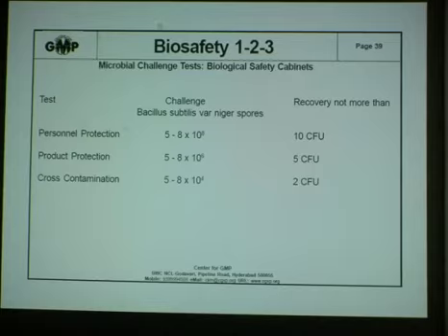Now the next thing you'd like to know is, is my culture protected? So, is the laboratory environment likely to compromise my culture? So how do you know that? You aerosolize a culture of subtilis from where the operator is sitting and try to see if you can capture or recover subtilis at the work surface. The procedure is explained in the standard. Now you aerosolize approximately 5 to 8 × 10^6 colonies where the operator is sitting and see if you can recover anything at the work surface. Ideally, you should recover nothing, but the limit given to you is 5 CFU.